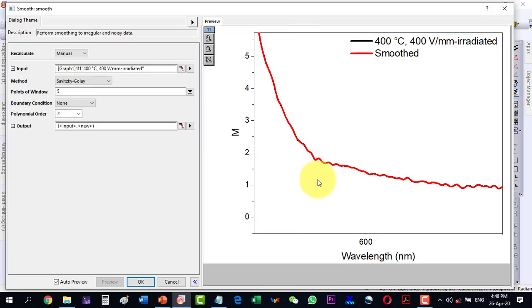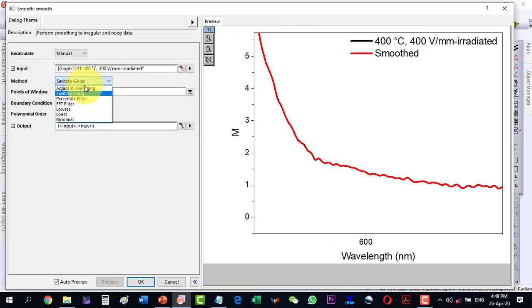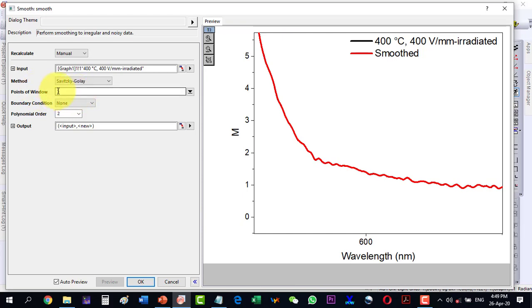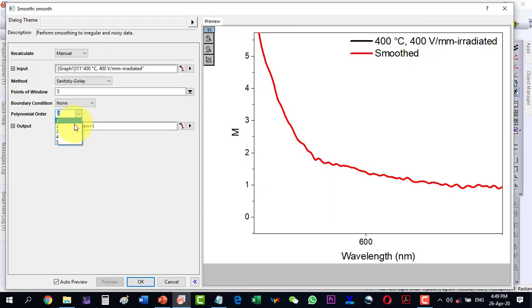Now we can play with the parameters. The very first option is the method, which is the Savitzky-Golay method. Another available method is Adjacent Averaging. We will proceed with the Savitzky-Golay method. The Points of Window parameter controls smoothing — as we increase the points, the smoothing becomes more pronounced and the oscillation peaks are ignored.